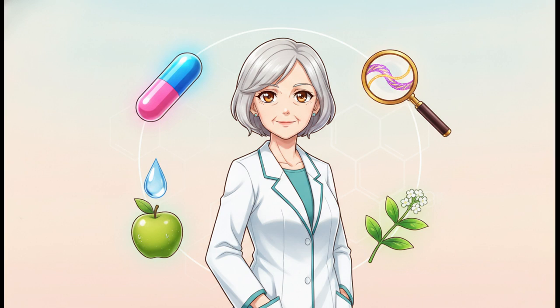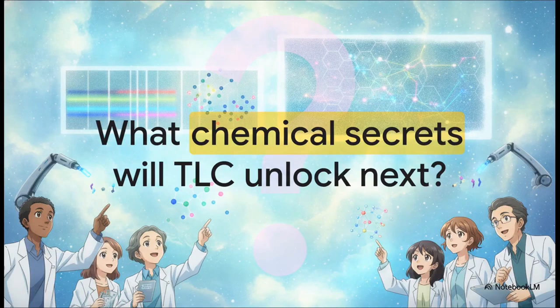Forensic scientists rely on it to break down the exact dye compositions of microscopic fibers found at crime scenes. Environmental labs use the extreme sensitivity of HPTLC to hunt for trace pesticides in our drinking water. And it's absolutely crucial for authenticating complex herbal supplements, ensuring that the label on the bottle matches the actual chemistry inside.